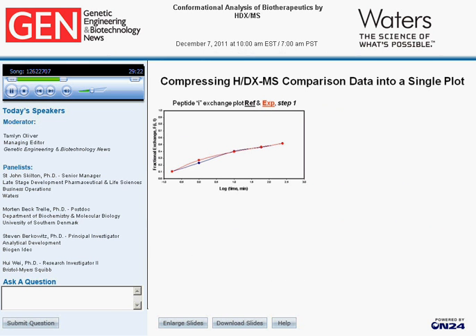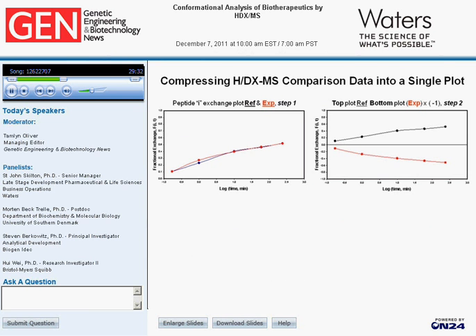So what we're going to do is take one plot, next slide, and then basically take the experimental and simply multiply it by -1. So we've more or less got a mirror image plot where we flip the experimental to the bottom. Next slide.